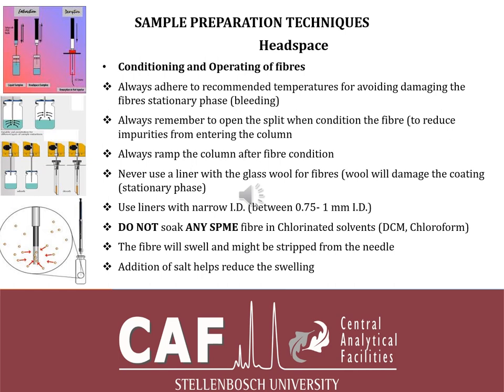Also, one of the things that one must never do is soak any SPME in a chlorinated solvent like dichloromethane or chloroform, because it will definitely strip the fiber. The fiber will definitely swell and strip. Addition of salt might help you to reduce the swelling.